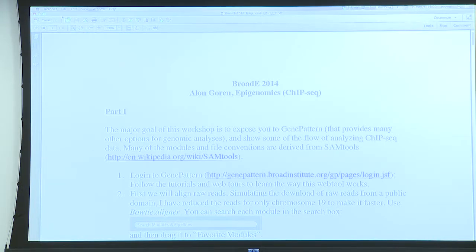And in general, what I want you to do is as follows. Whenever we do a study, either for ChIP sequencing or RNA sequencing or any genomic study, the beautiful part is that we can deposit the data into public domains, such as GEO, or ENCODE has all of the data in specific locations and so on. And what makes it really nice in my mind is that now you can follow up on other people's studies and use what they've done in order to further the knowledge in biology.